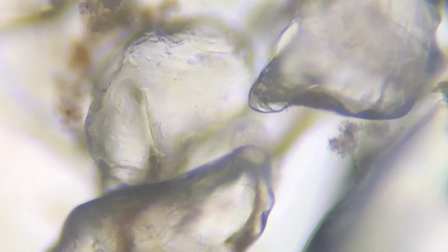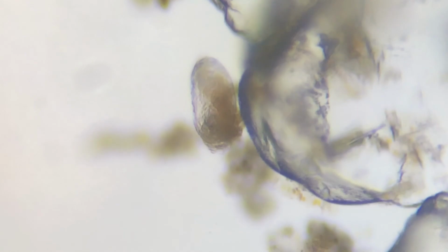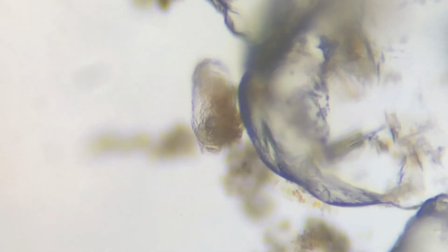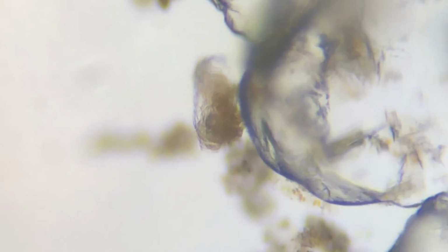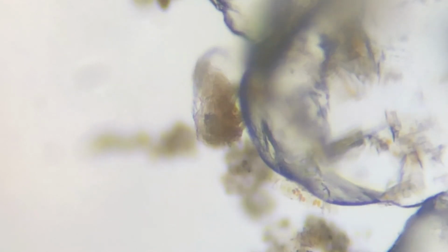If you've watched my Sample 1 Video 3 post, you can most likely recognize this organism. This is the Dicranophorus rotifer. In the previous video, I noted that my specimen lacked the characteristic corona of the Rotifera genus. But with the new camera quality, the corona are visible, and if you look closely, you can see the vortex it creates.